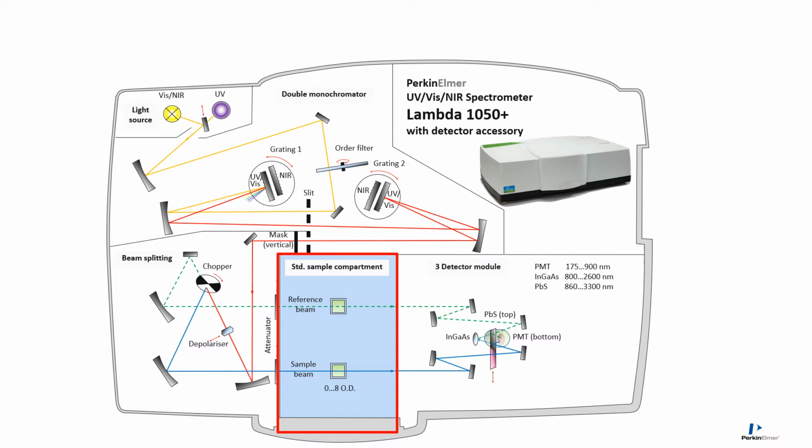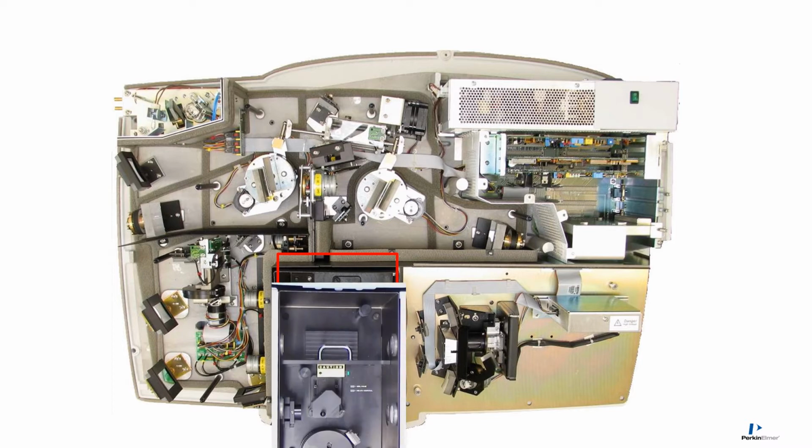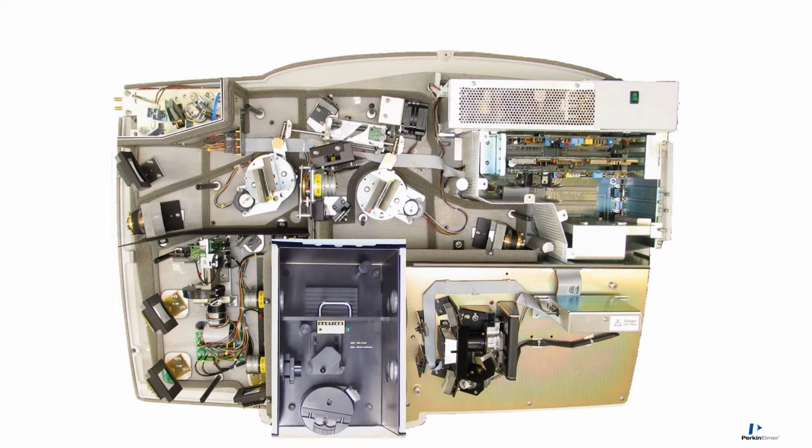In most cases, an integrating sphere will be required within the detector compartment area due to the reasons highlighted earlier. The beam-sample interaction can compromise the necessary comparison between baseline and sample measurements. And here is the actual compartment again, highlighted now in red. And now we have figuratively installed an appropriate sample compartment accessory. These exist in a variety of designs. Some of them are very accurate, but they therefore require extra user care and attention.